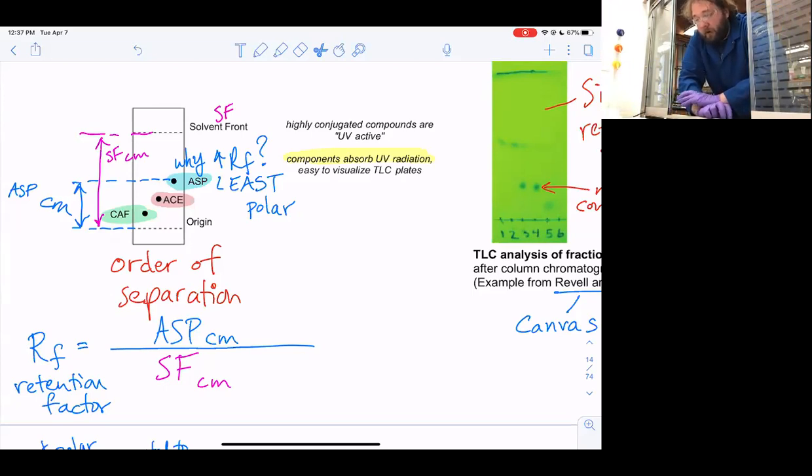And all I'm going to do is, I've already taken a microspatula of each of them, put them into the separate containers. Now all I'm going to do is take about a milliliter of acetone to dissolve it. And then from there, we can actually start spotting our standards. And I will show you how to do that as soon as I get these dissolved.